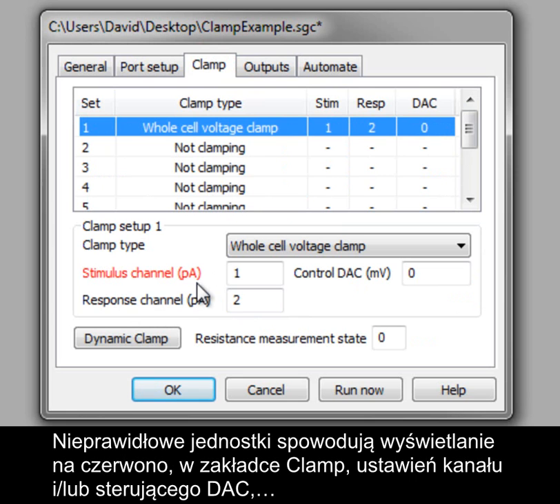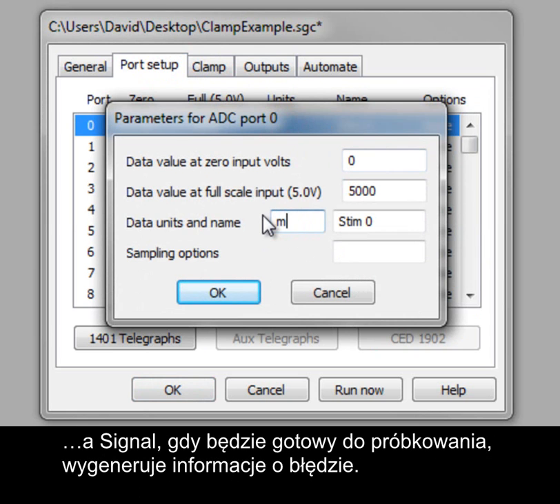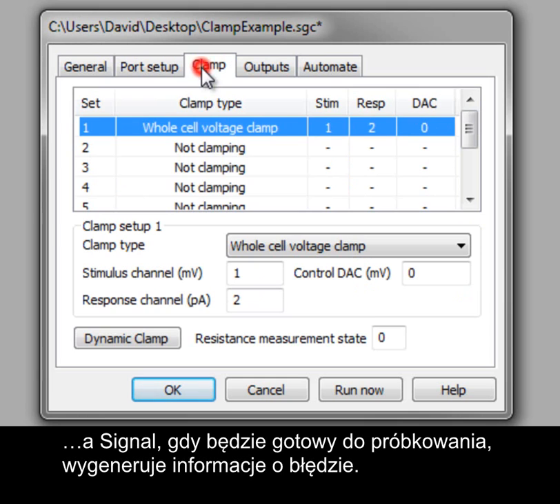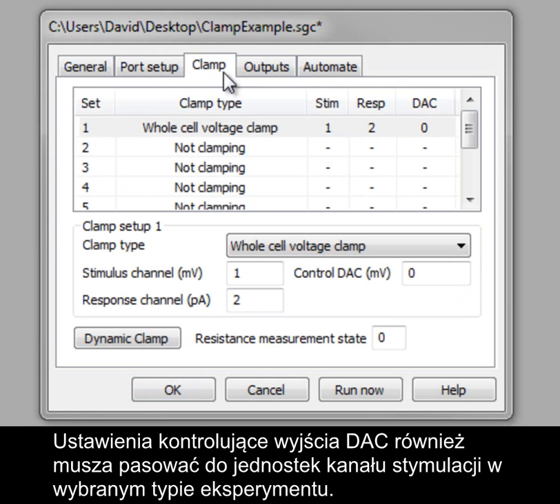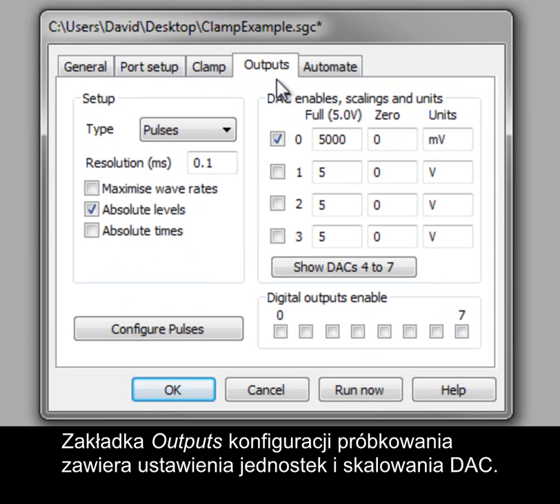Incorrect units will cause the channel and/or control DAC settings to be displayed in red in the Clamp tab, and Signal will generate an error message when ready to sample. The control DAC output must also be set to match the units of the stimulus channel for the selected experiment type. The Outputs tab of the sampling configuration holds settings for the DAC units and scaling.